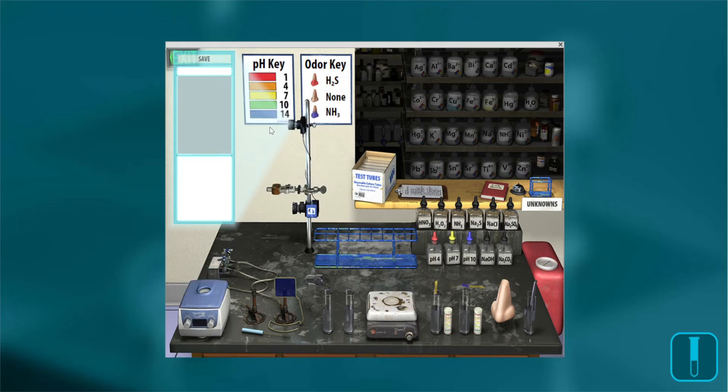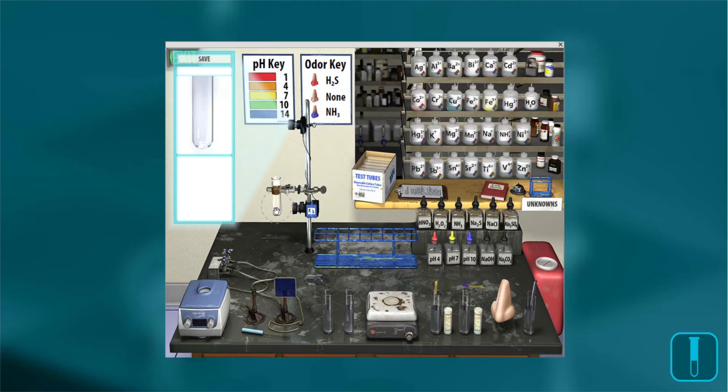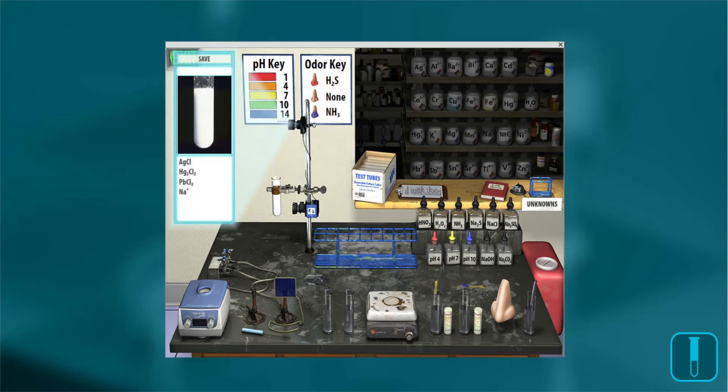You can have them add multiple cations to a test tube. For example, if they add three cations and then add chloride, they've made several insoluble chlorides. Now how would we separate those out? Students will need to learn the steps to separate and distinguish between them.